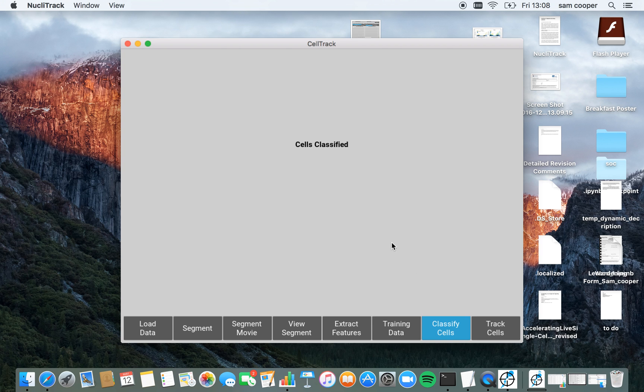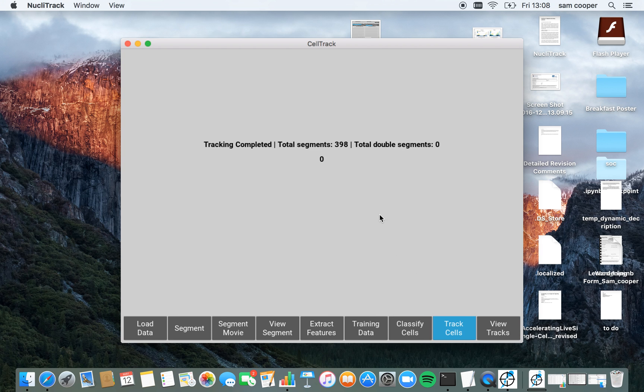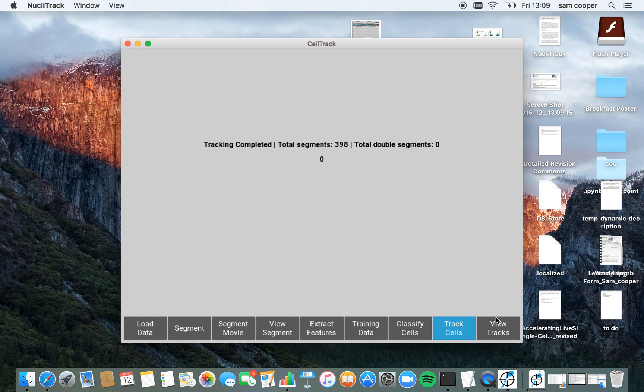Go ahead and classify the cells and now track them. Tracking has been completed and you can see that NucleoTrack has identified 398 segments which are effectively, which now feature in the track cells.